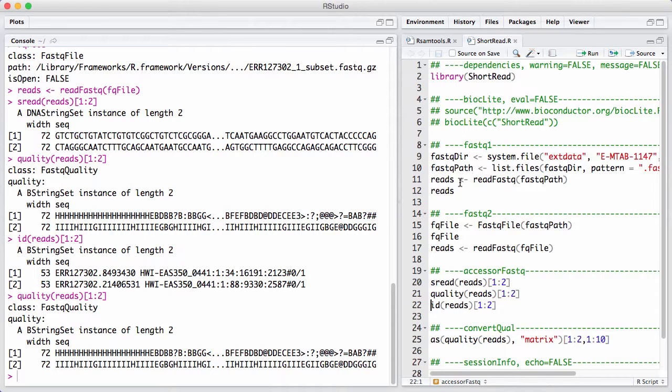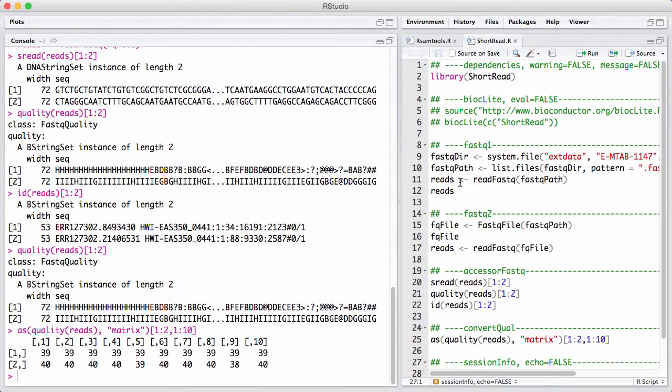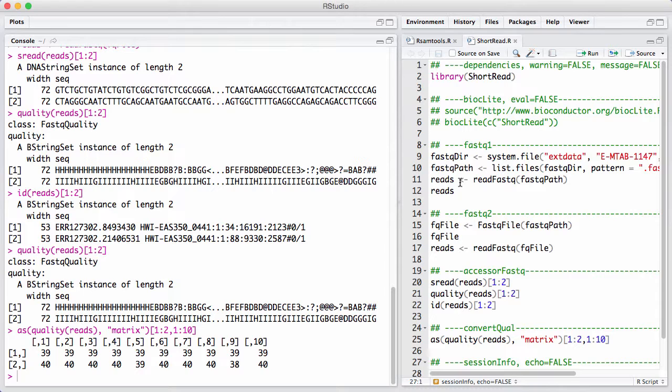So here, I call it as a matrix, and I show the first two reads and the first 10 bases of the first two reads. So we can see here by comparing to the thing upstairs that 8 gets translated to 39, and I gets translated to 40.